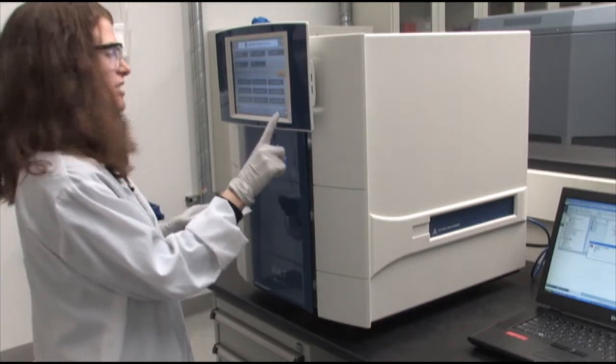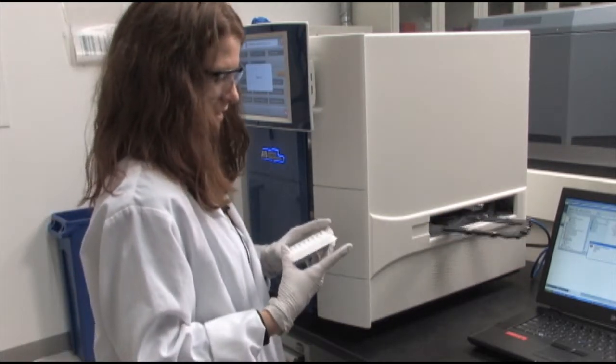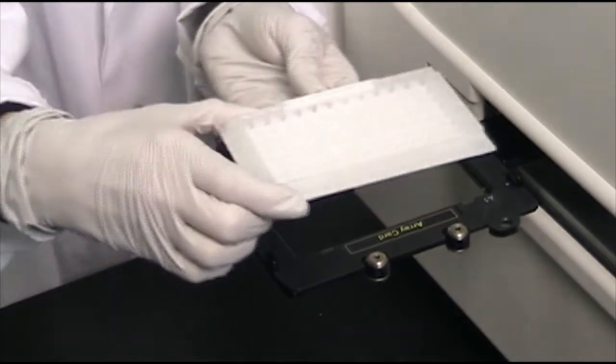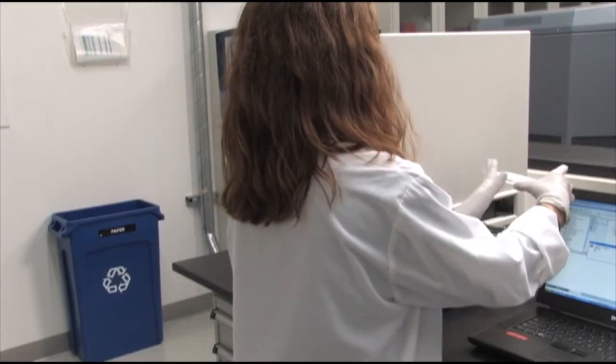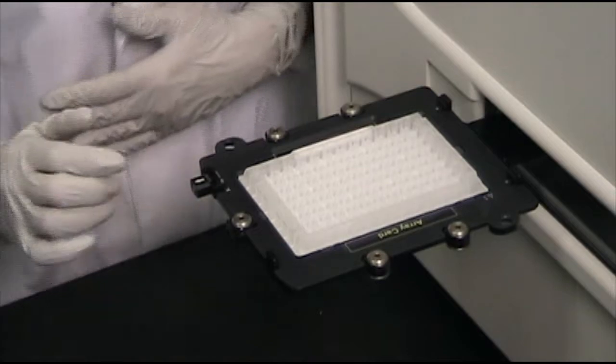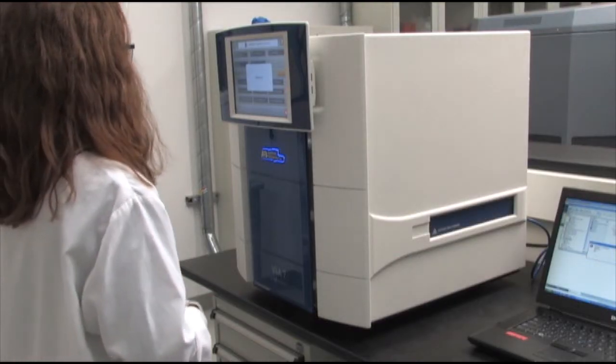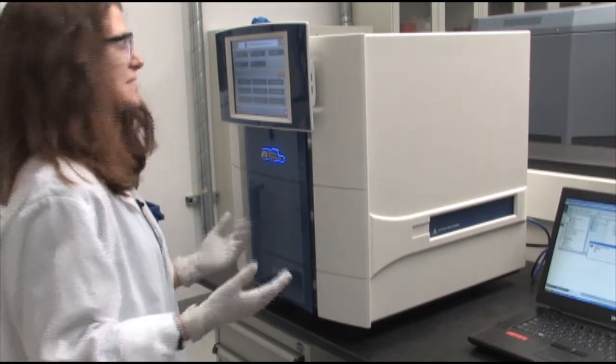I'm going to press the red Eject button to open up the tray. Now I'm going to put the Array card into the Array holder — the barcode faces towards me. I press the red button again. The card's now loaded.